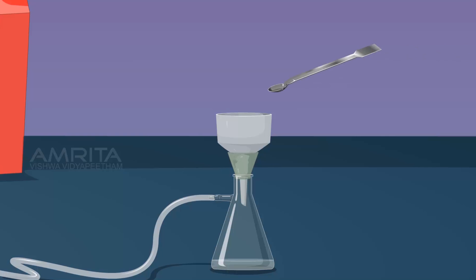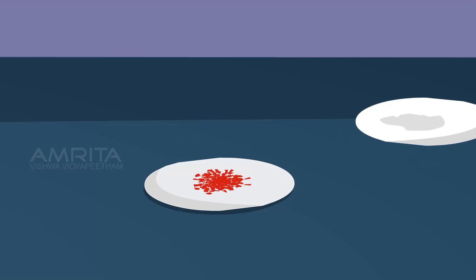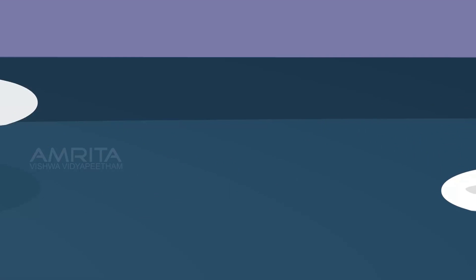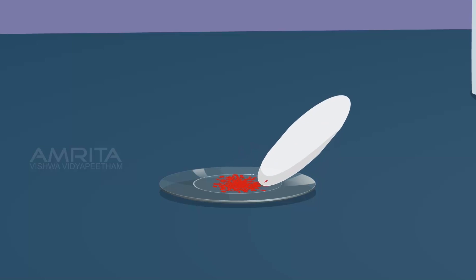Using a spatula, transfer the crystals into a filter paper. Dry the crystals in the filter paper by pressing it with another filter paper. Transfer the dried crystals into a watch glass and label it as 2-naphthol aniline dye.